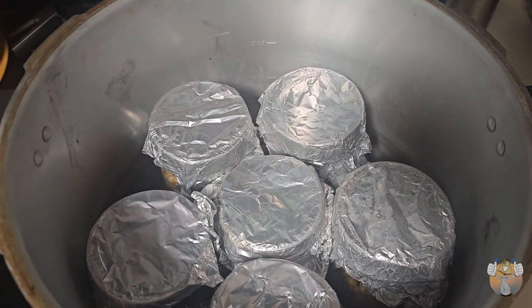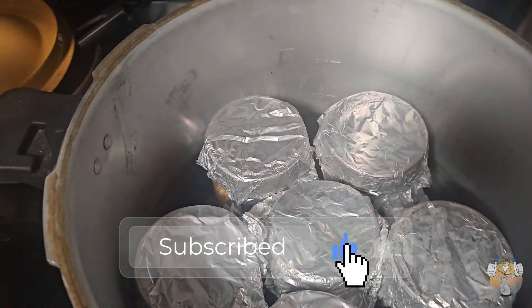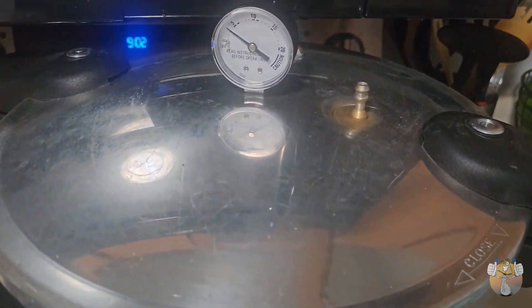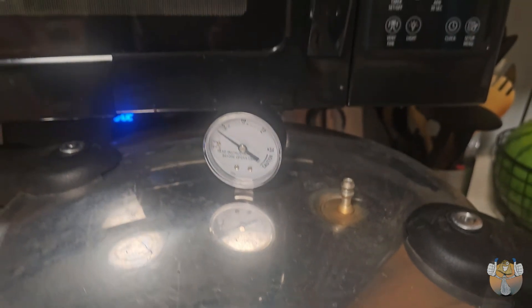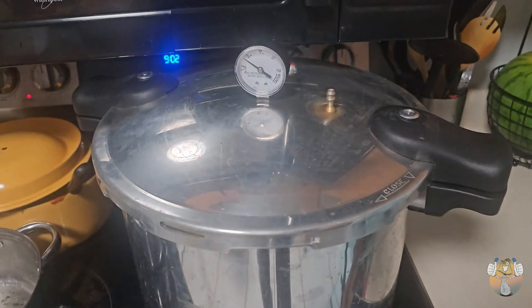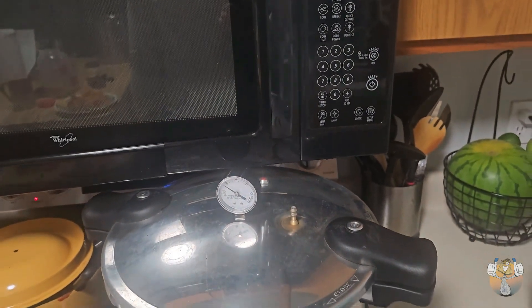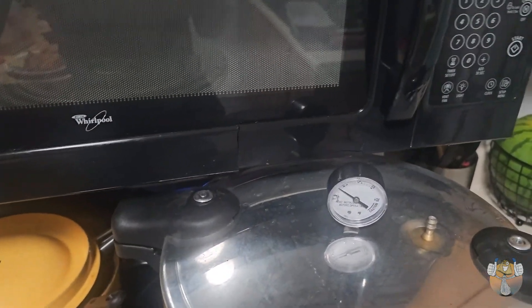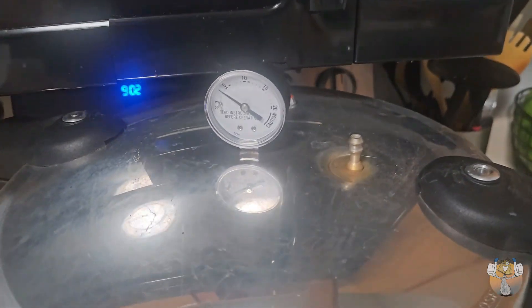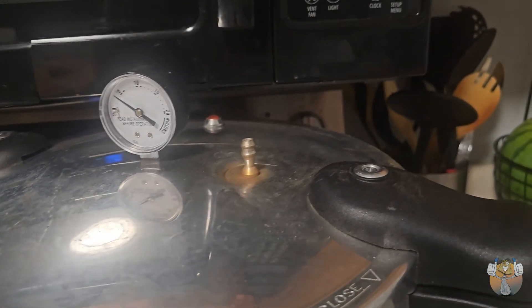I'm gonna go ahead, add some water, get this thing started up and take you guys to the next step. Pressure cooker disclaimer — this is what I do: I'm letting the pressure build up inside of the cooker for a few minutes so that we have a steady stream of steam coming out of that nozzle. Then I cap it off with the weight and let it build the pressure up to 15 PSI.